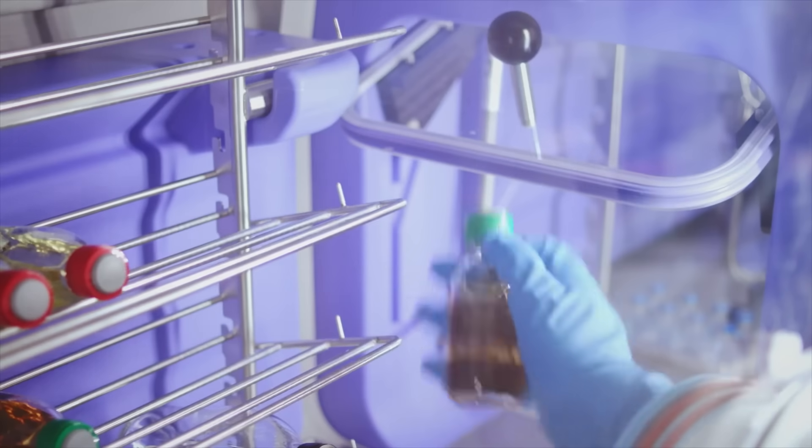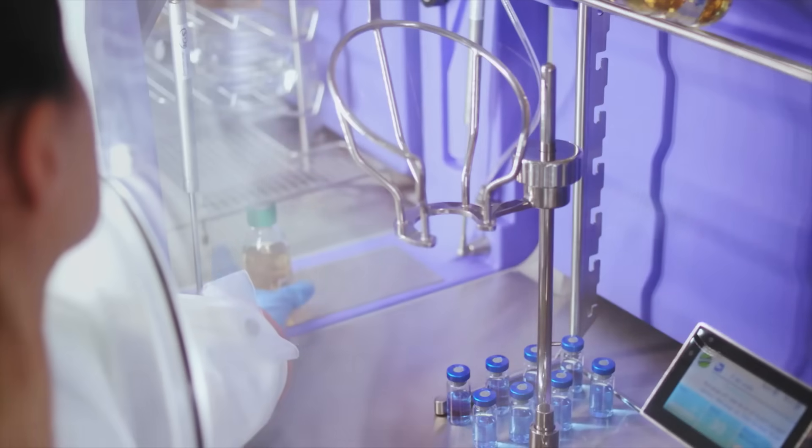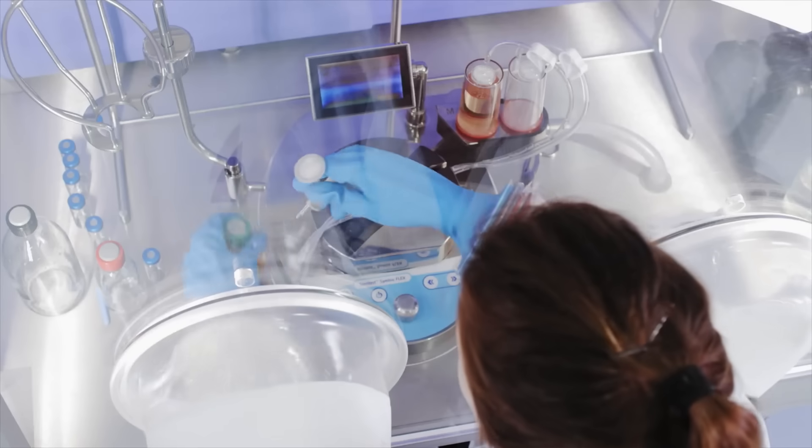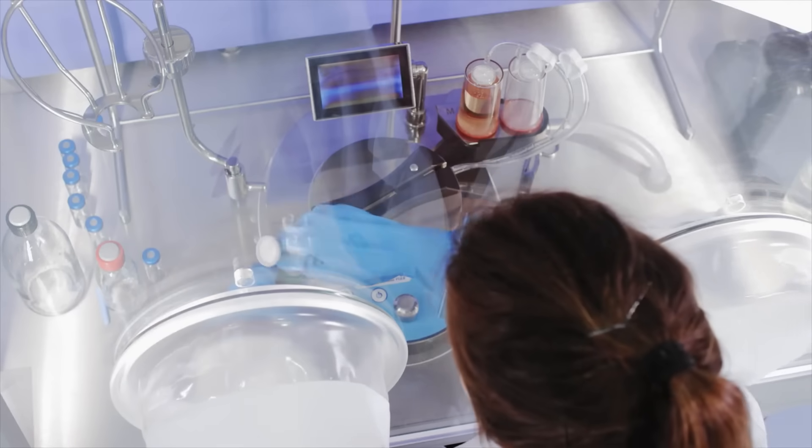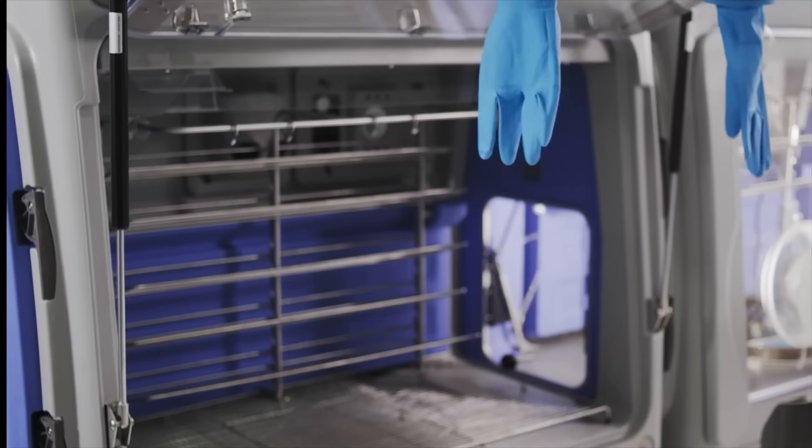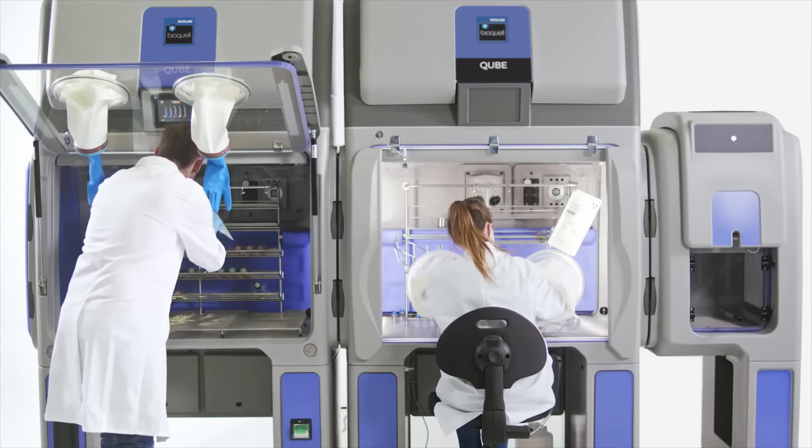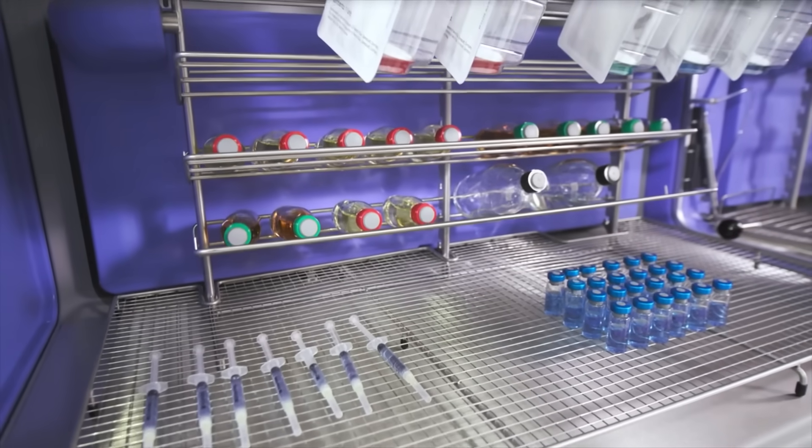The decontaminated supplies are transferred to the workstation with the pump to begin testing. Operators can now safely perform tests while additional supplies are being loaded and decontaminated in the adjacent workstation, creating a nearly unimpeded workflow.